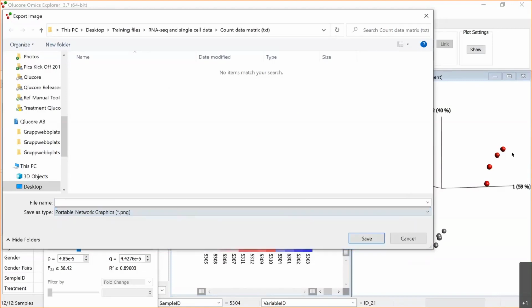And the next question, is it possible to include the normalization method for DESeq2? So far we don't support DESeq2, but that's on the list to do. So we hope to include that in the upcoming version. So far, no. So if you want to use that, then you can pre-normalize your data and just read in the pre-normalized data set through the wizard.